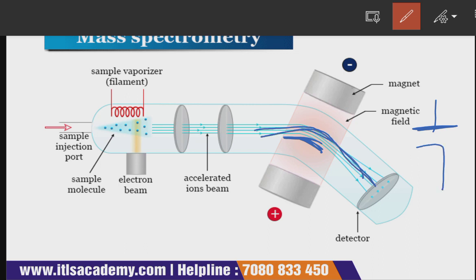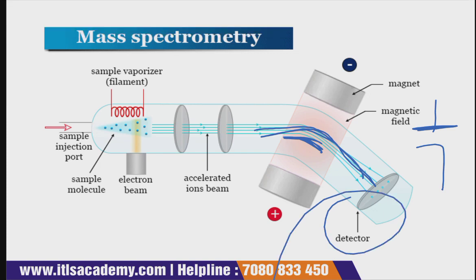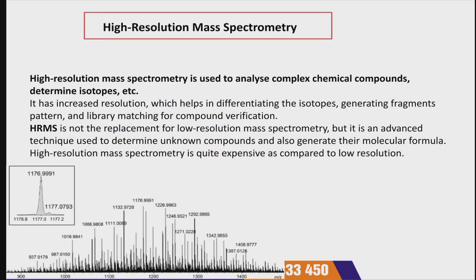Here the detector is present to detect the signals. Now comes high resolution mass spectrometry.